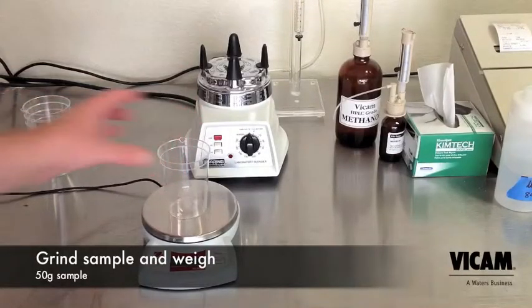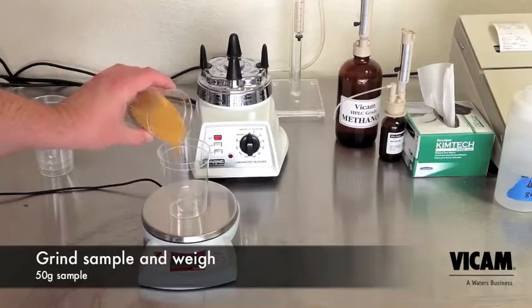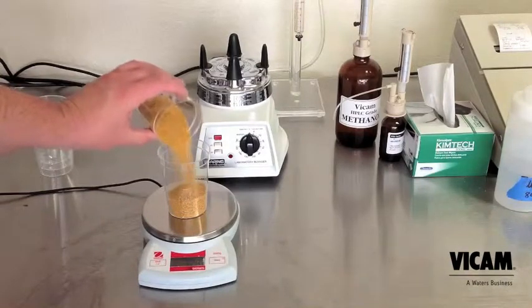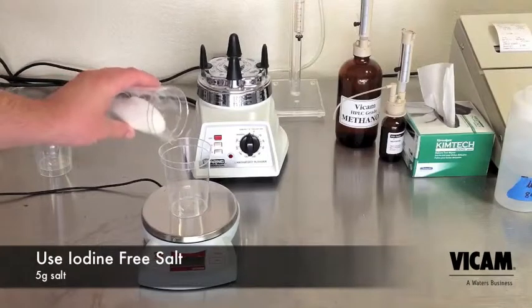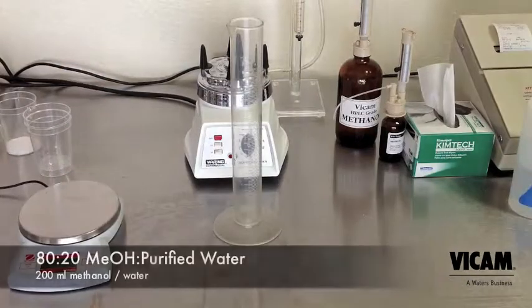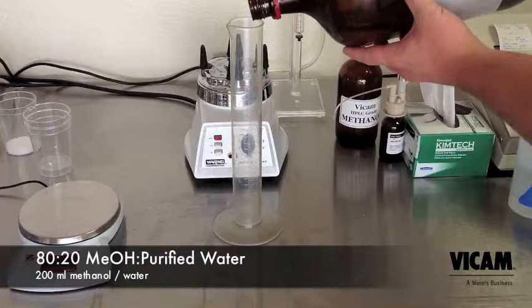First, grind your sample. A slightly coarse grind like you'd use in a drip coffee maker is appropriate. Measure 50 grams. Next, measure 5 grams of iodine-free salt. Measure 200 milliliters of 80-20 methanol and water.